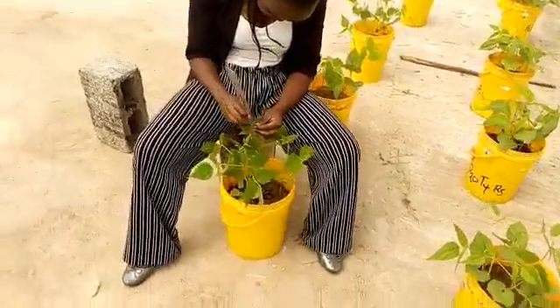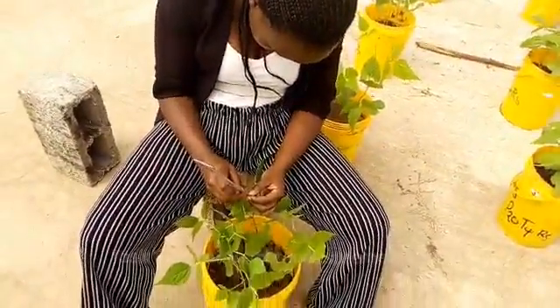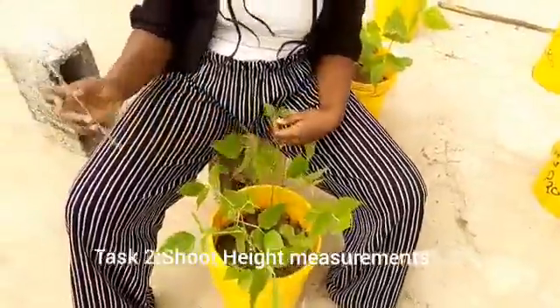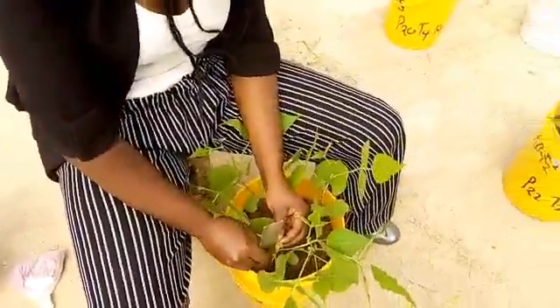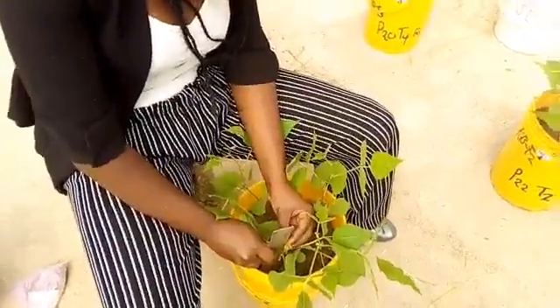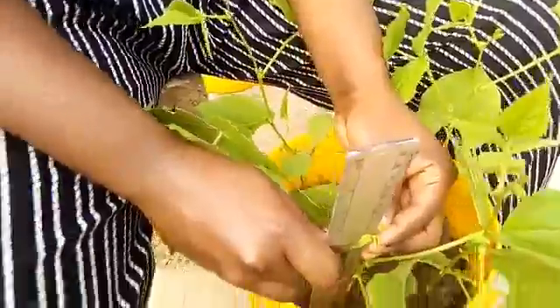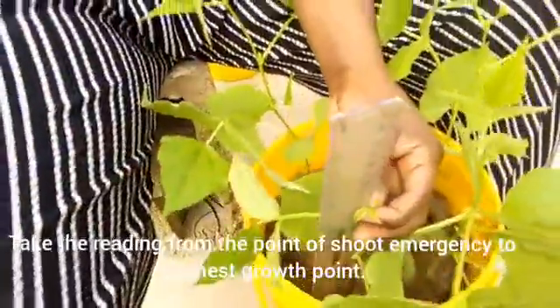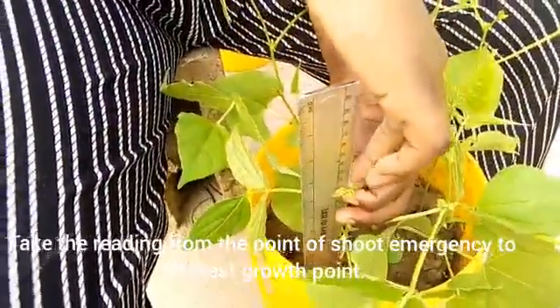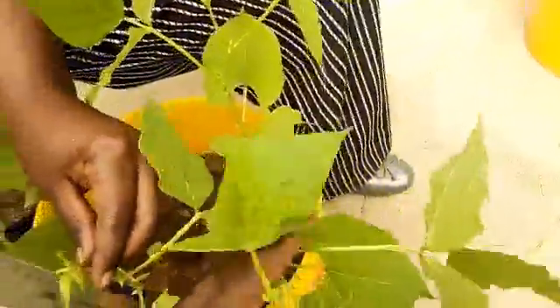Hello again. As you can see, my colleague Luwi here is taking shoot height measurement. What she's doing is using a 30 centimeter rule to take the shoot height, and the point where she's taking the measurement from is the point of the freshest leaf, yes, the freshest leaf where the new growth is taking place. Let me take for instance the same plant that she's taking the measurement on.